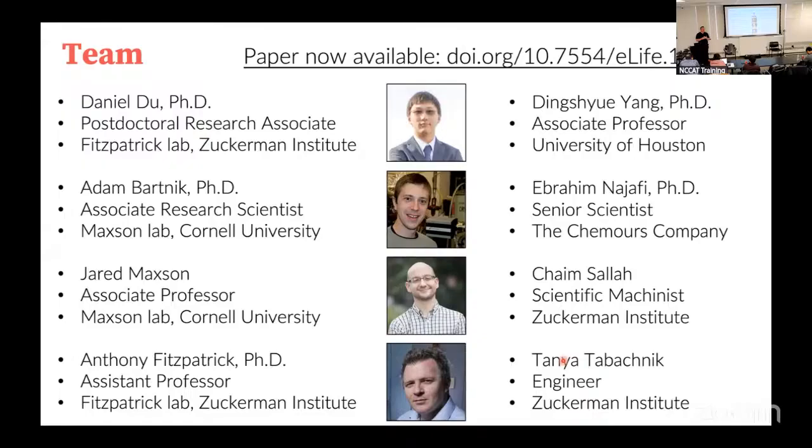Because this is probably going to happen for the field. One of the ways that tomography will get better is just to get better primary data. So they put in a resonator. One of the challenges with the resonator is that once it's in, it is fixed. You cannot change it. It is going to sit there. The mirrors are going to be there. And I think that some of the challenges with that are the following.